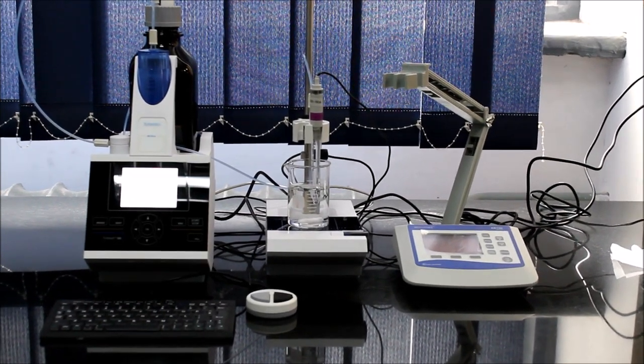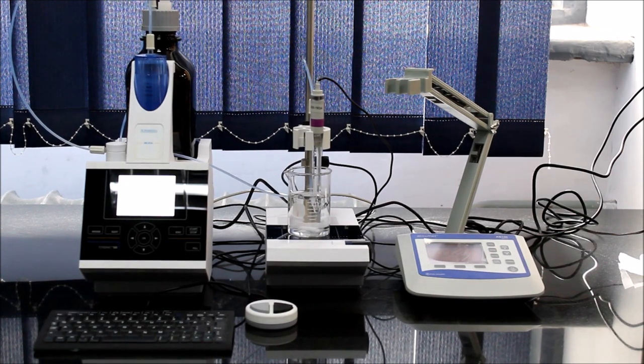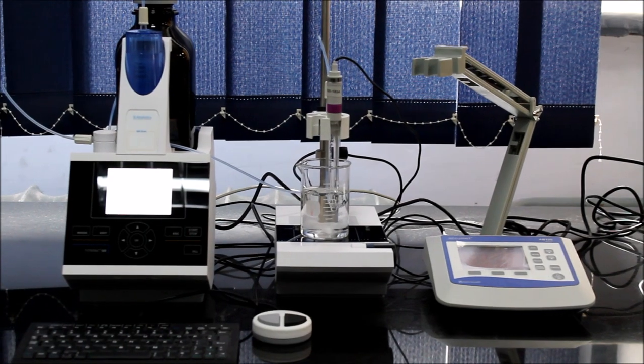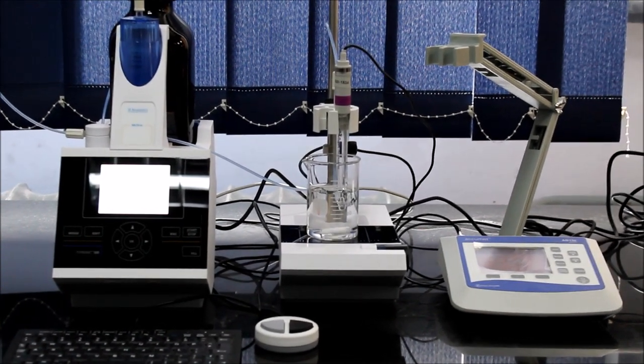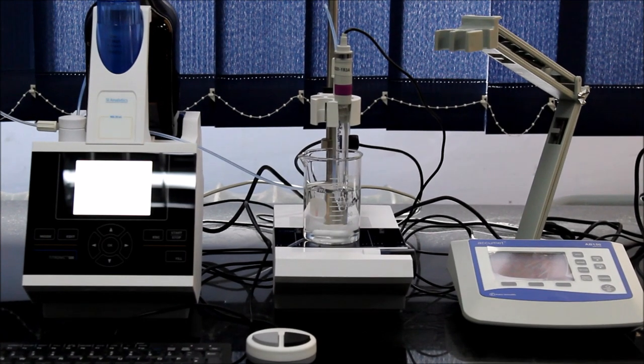This is an experiment set for our titration lab which consists of an autotitrator located on the left and the pH meter on the right. This type of set is ideal for titration experiments that require high accuracy and involve many samples.